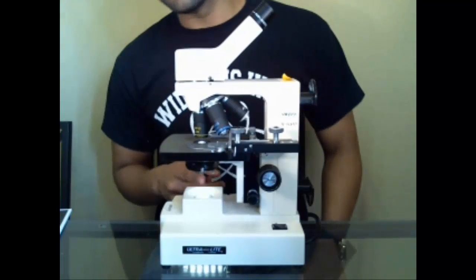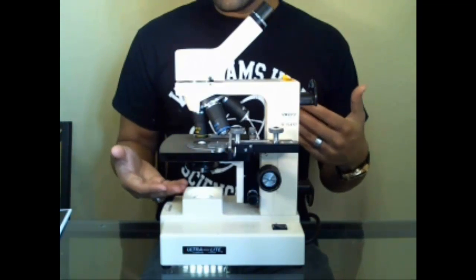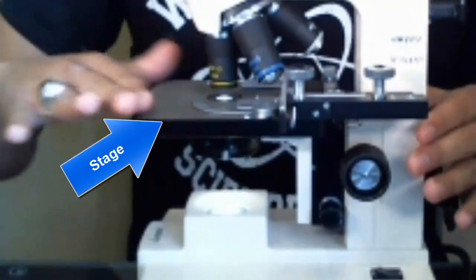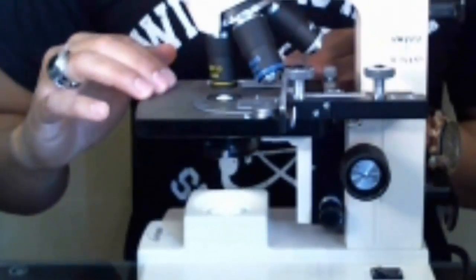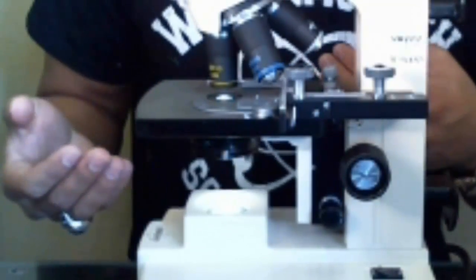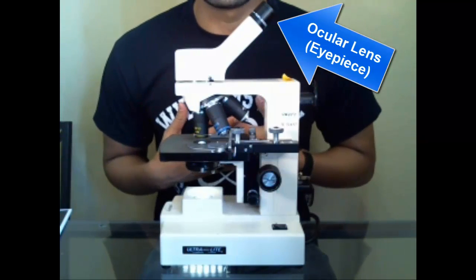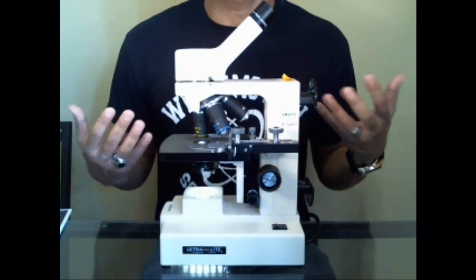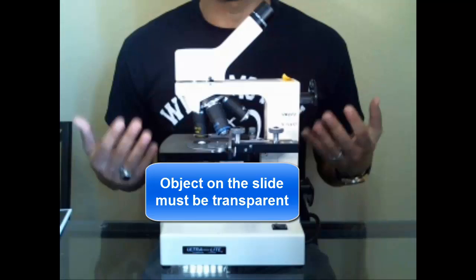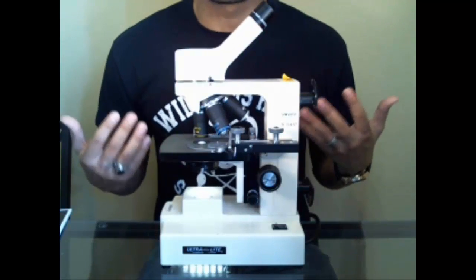The light passes in from the bottom, and it's very important you understand that because you need light to end up in your eye to see what you're looking at. It has to actually pass through what you're looking at here on the stage. The light bulb is at the bottom; on the stage in the middle is where you actually put your slide. The problem is it has to allow light to pass through, so what you're looking at must be transparent enough.